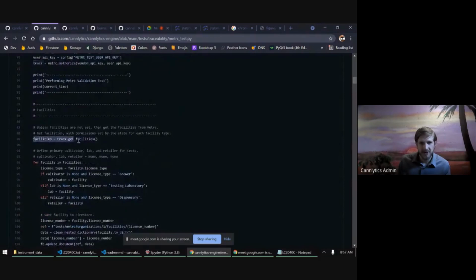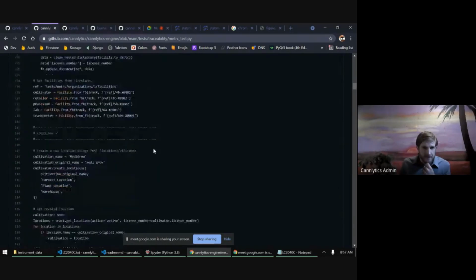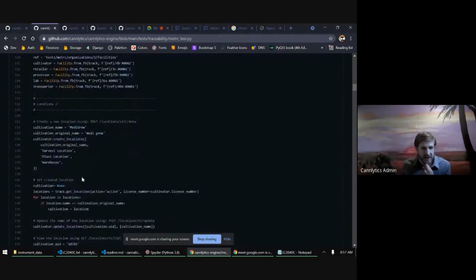You can get your facilities, and the reason that's important is you'll want to know the license number of your facility. In this example, you'll notice we're creating locations, and I actually pass a license number here.